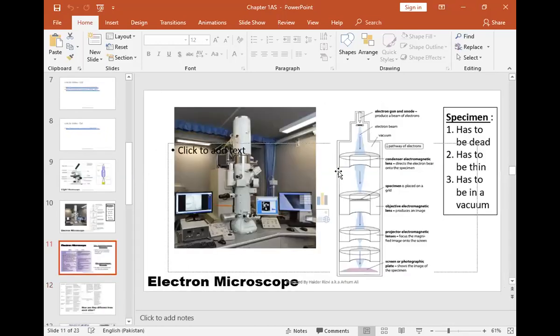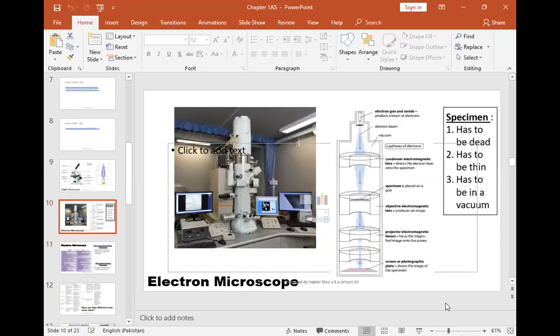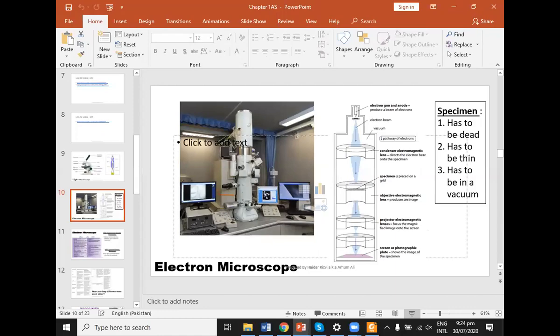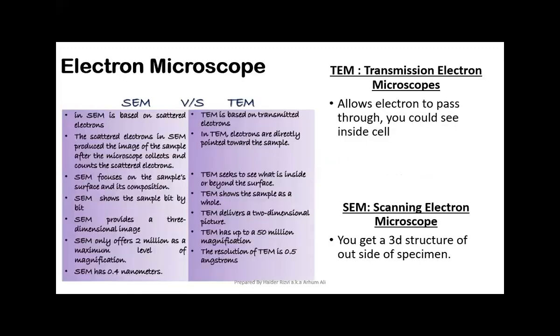Then आपको पता होना चाहिए about the working of the electron microscopes and the light microscopes. and हमने भी डिस्कस किया था कि ये जो on the right side ये वाली जो पिक्चर है ये आपकी बुक से ही ली गई है, and it's a simplified picture जो आपको बताती है कि किस तरह से आपका एक इलेक्ट्रॉन माइक्रोस्कोप वर्क करता है.